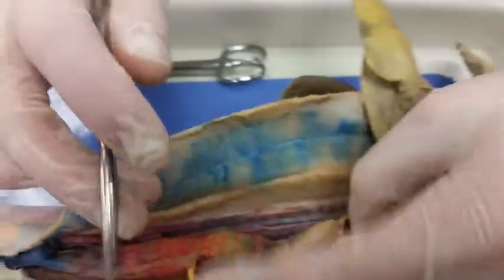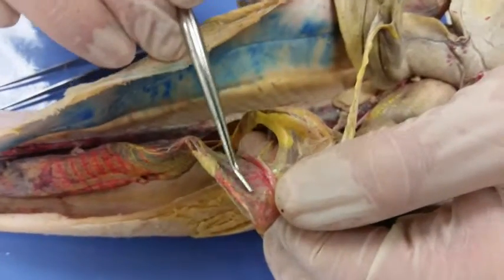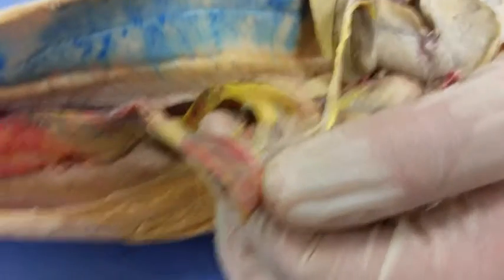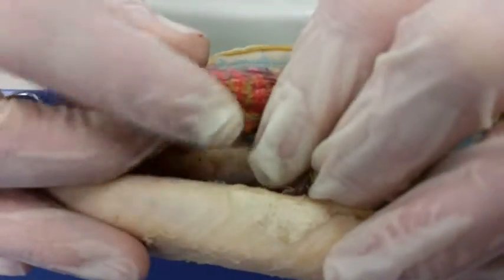The duodenum is going to lead us to the pancreas, which is identifiable because of the large amount of vasculature on the underside. Then we have valvular intestine right there. Very, very easy to see.